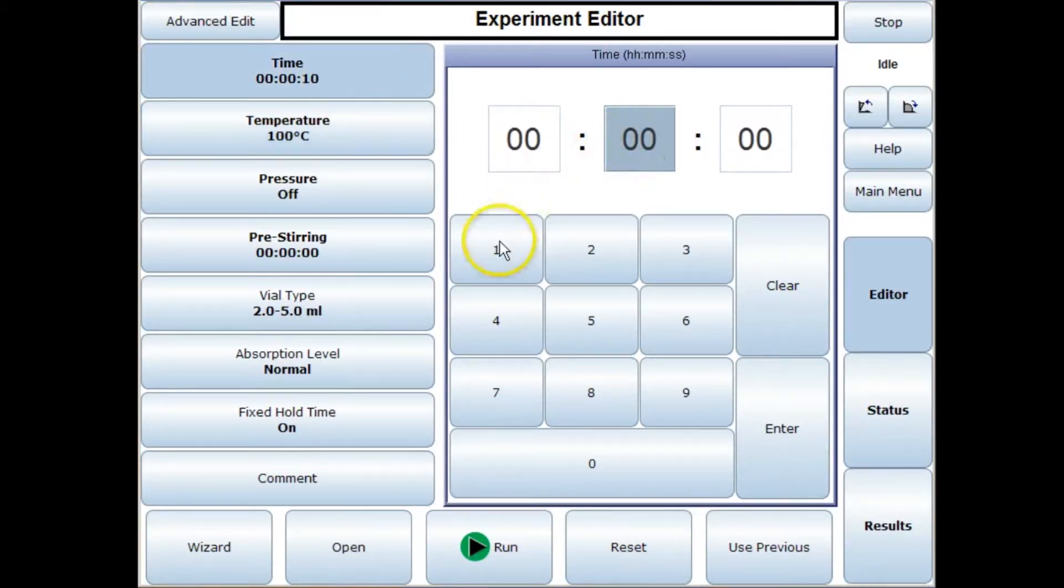So let's say we want to put a reaction on for 12 minutes. We enter the time, we press enter, then we select the temperature for the reaction. Let's say 100 degrees. We press enter.